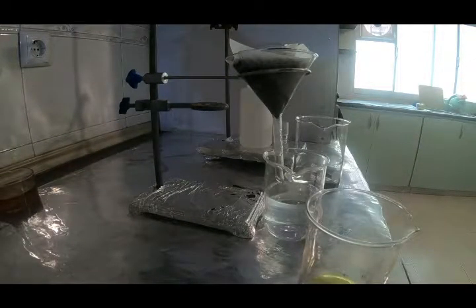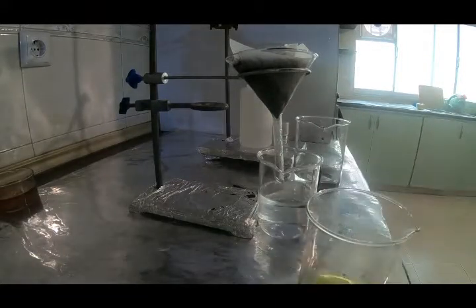Okay, the filtration is done. Now we can put the carbon in the oven at 100 to 120°C for about 1 hour, so it can be dried. And after that, we can proceed to the rest of the experiment and load the palladium on the carbon.